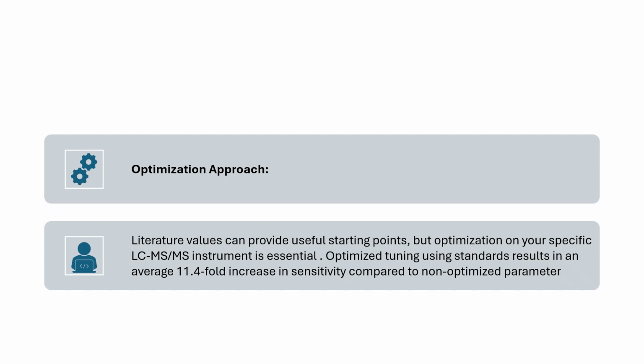So optimization approach. Mostly you get data from literature, but optimization on your specific LCMS instrument is essential. Tuning using standards results in an average 11.4-fold increase in sensitivity compared to non-optimized parameters. Therefore, you need to optimize your molecule on your instrument.